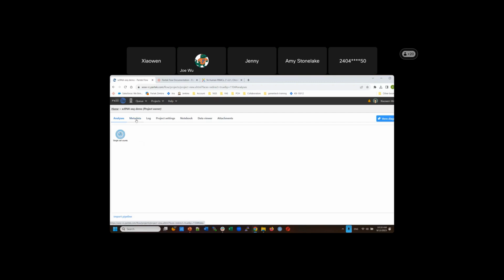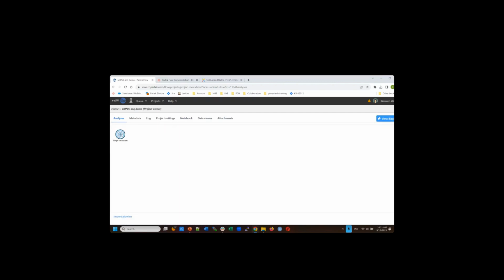If you want to import more samples, you can add more. Okay. All right, so now if you click on this data node, you can also add data from here too. If somebody already analyzed the data, you can add all the annotation information, but since this is raw, we don't have anything.